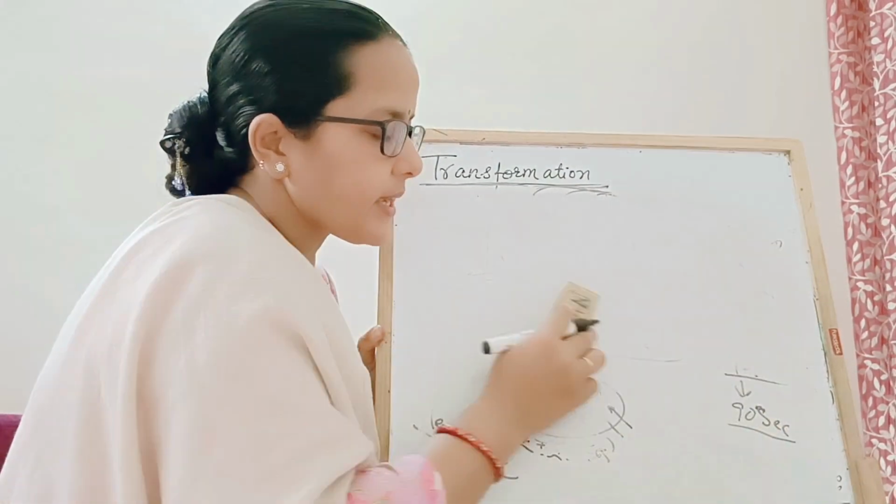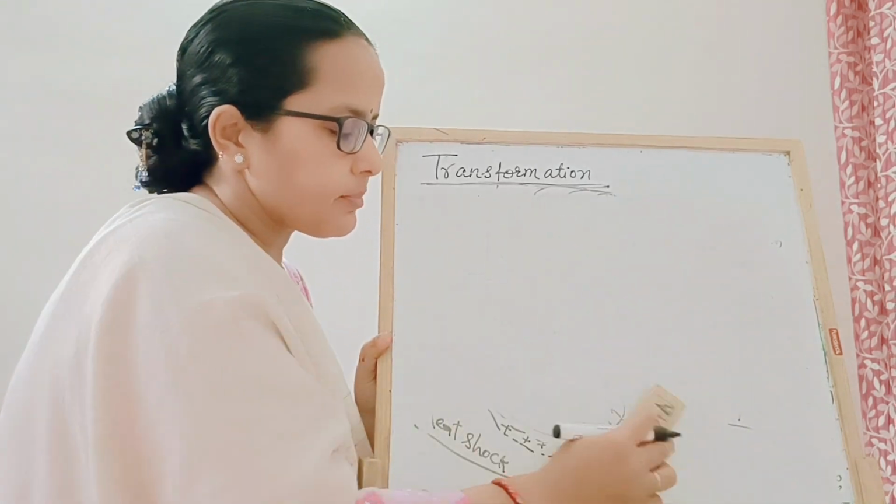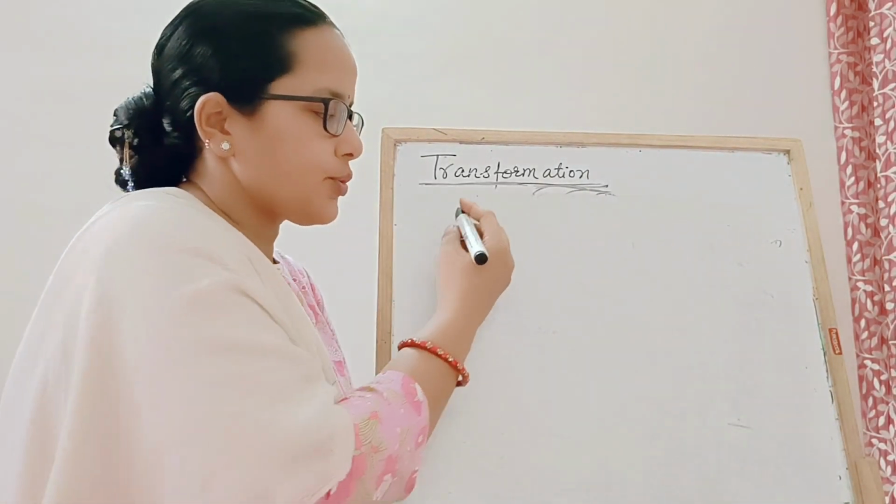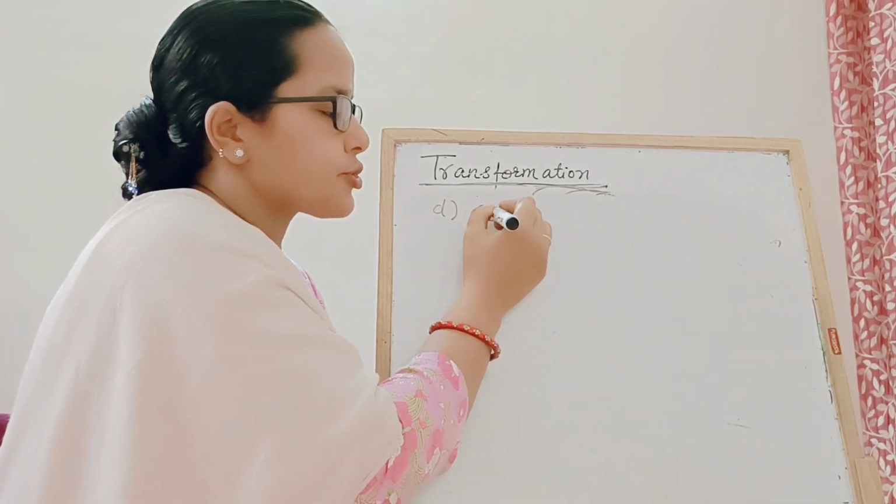क्यों देना है हमें cold shock? As I have explained, heat shock हम देते हैं ताकि cells membrane खुले and cells will get entry into this. Now you have to give the cold shock.